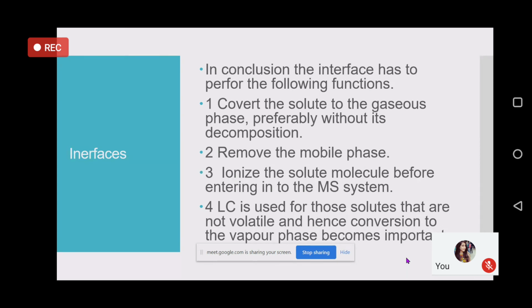So why and when an LC-MS system will have to be used is my question. When LC itself is efficient, a versatile method, a superb technique which can separate everything under the sun, that is what we usually talk about. So with all these qualifications, why should one go for LC-MS is the question.